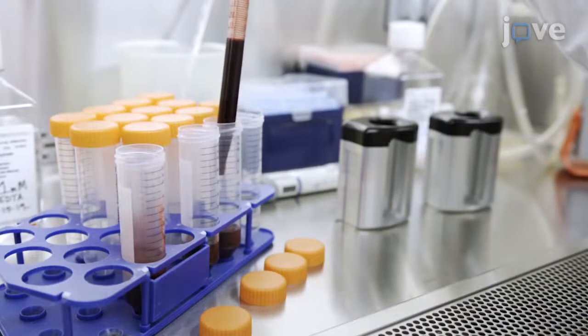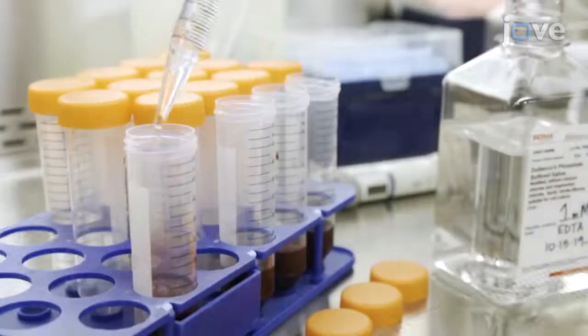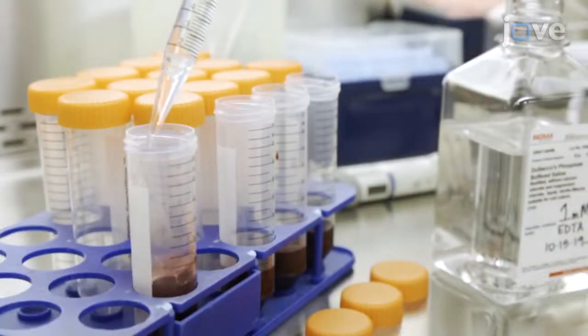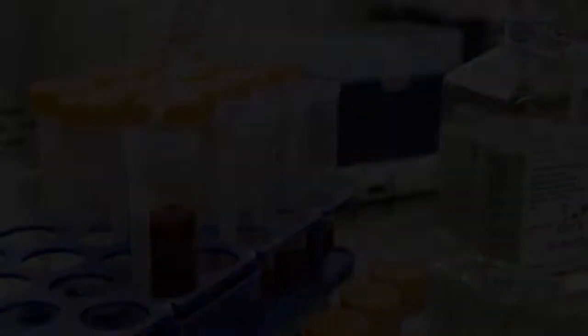After 5 minutes at room temperature, split the blood equally between four 50 mL tubes and add 30 mL of sterile PBS supplemented with 1 mM EDTA to each tube.